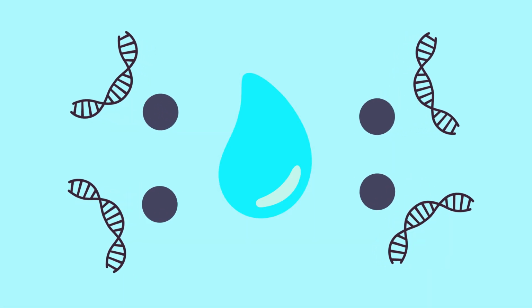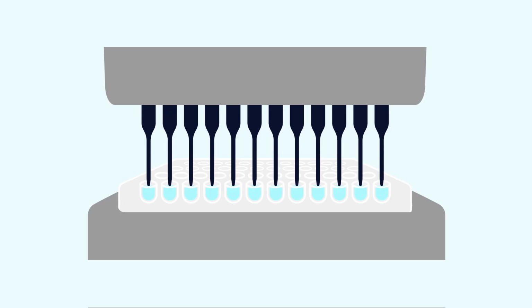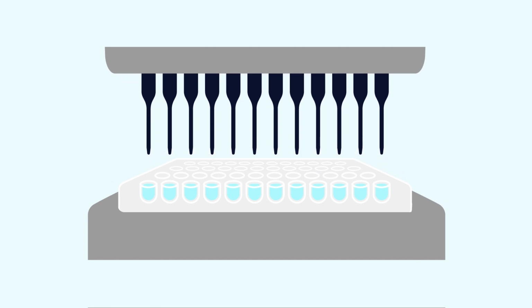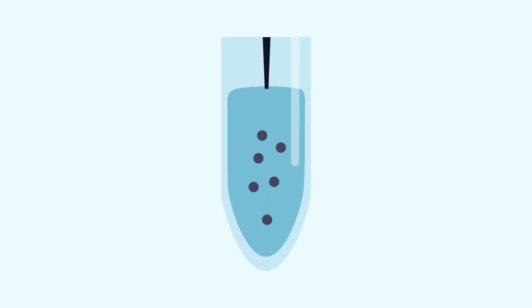If faster mixing doesn't improve bead suspension, try washing the sample with water or TE buffer and mixing vigorously. This elutes nucleic acids from the beads and breaks aggregates. Rebind the nucleic acids by adding binding buffer at the exact ratios used in the binding step.